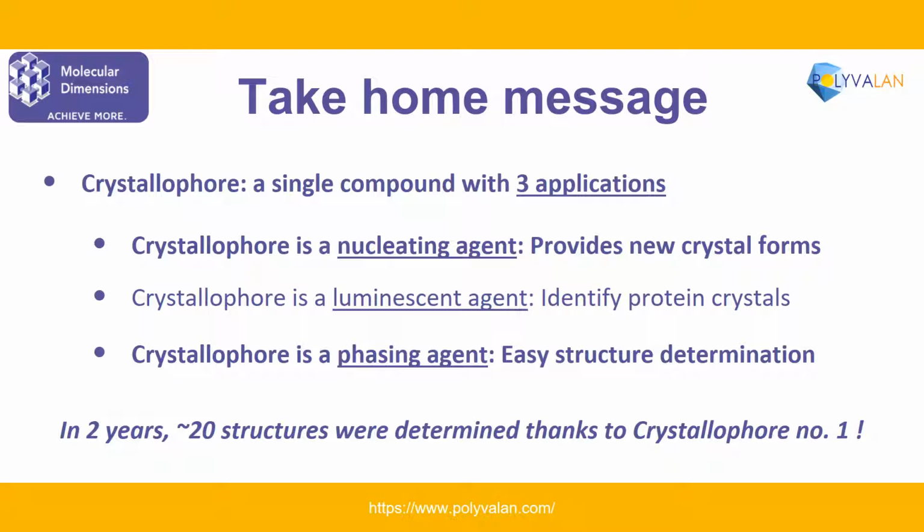We finish this presentation by mentioning that, to our knowledge, and over the last 2 years, about 20 protein structures have been determined thanks to Crystallophore, including our test panel, but also 2 unknown protein complexes.